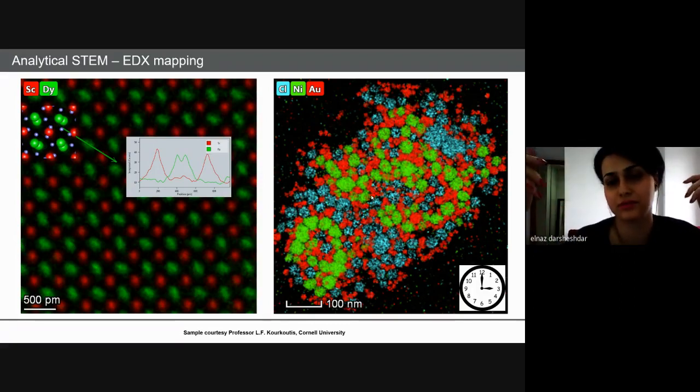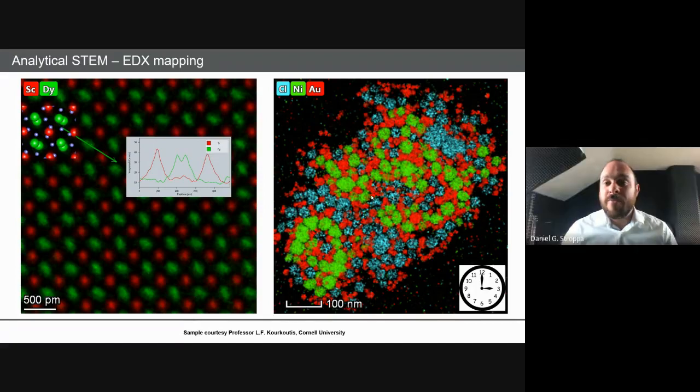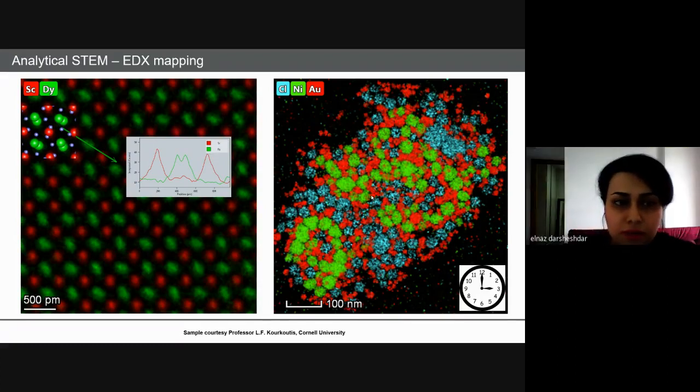Okay, and I wanted to know that with both STEM and TEM, we can get both the crystal structure and also the chemical composition, right? Well, yes, but the STEM mode, the TEM mode, and the diffraction are done in the same microscope. It's the same equipment that can do all of those. It's actually a click of a button to change the optics and to go between the modes.